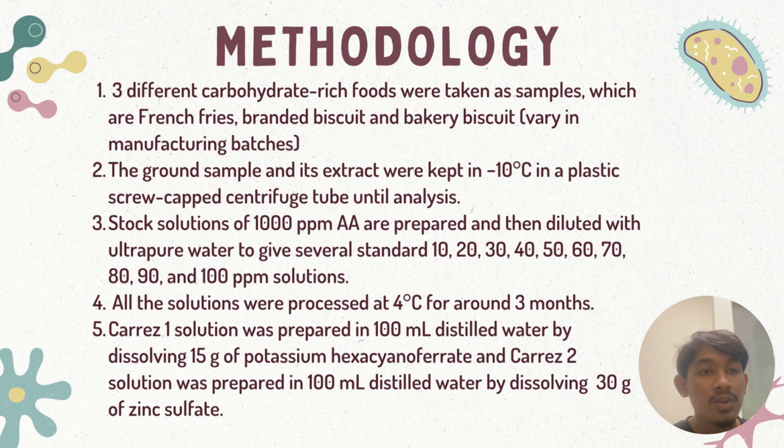All the solutions were stored at 4 Celsius for around 3 months. Whereas Carrez 1 solution was prepared in 100 ml distilled water by dissolving 15 grams of potassium hexacyanoferrate, and Carrez 2 solution was prepared in 100 ml distilled water by dissolving 30 grams of zinc sulfate.